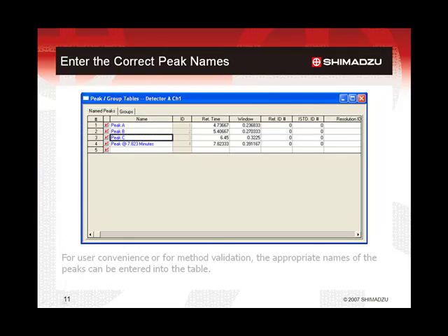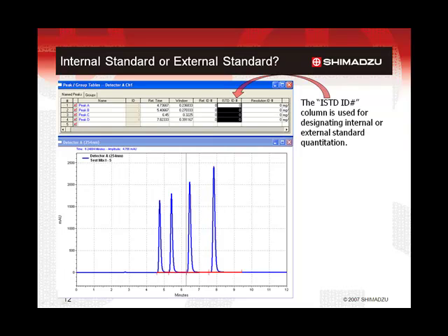It is often more convenient to the user to be able to supply names for the peaks of interest. In the peak table, peak names may be entered to a maximum of 50 characters. The internal standard ID column is where the selection can be made for quantitation by external standardization or internal standardization. If all the cells are set to zero, then the quantitation will be by external standardization, which simply creates calibration response factors from the ratio of the standard amount to the size of the standard peak.